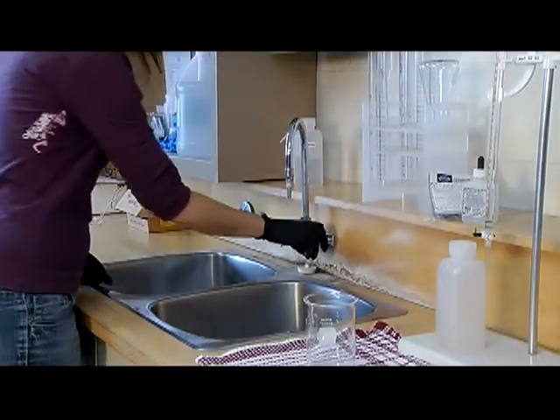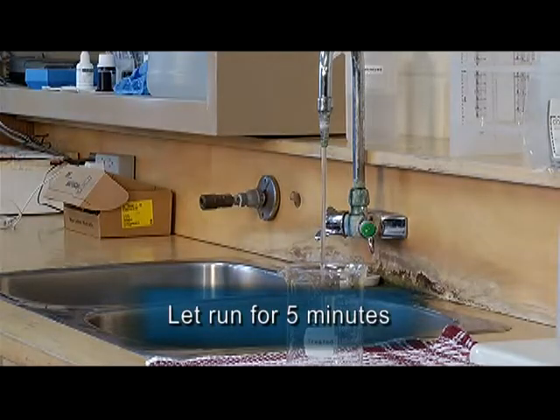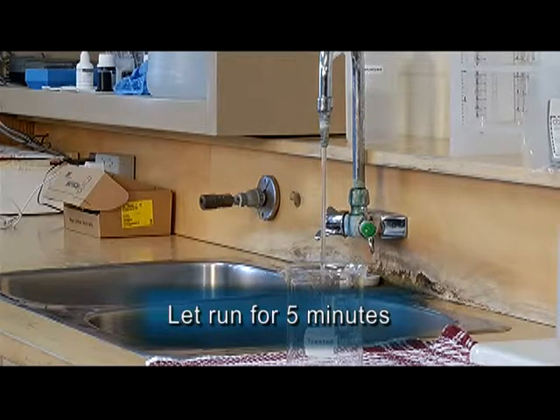In obtaining a representative grab sample for onsite chlorine testing, plan ahead and run the tap for the prescribed time of 5 minutes. Running the water clears standing water from the plumbing so that the sample water is representative of chlorine within sampling points at the treatment plant or in the distribution system.